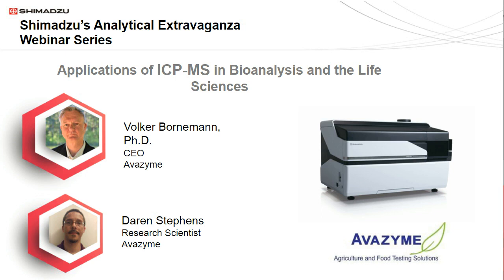Our topic is Applications of ICP-MS in Bioanalysis and the Life Sciences.